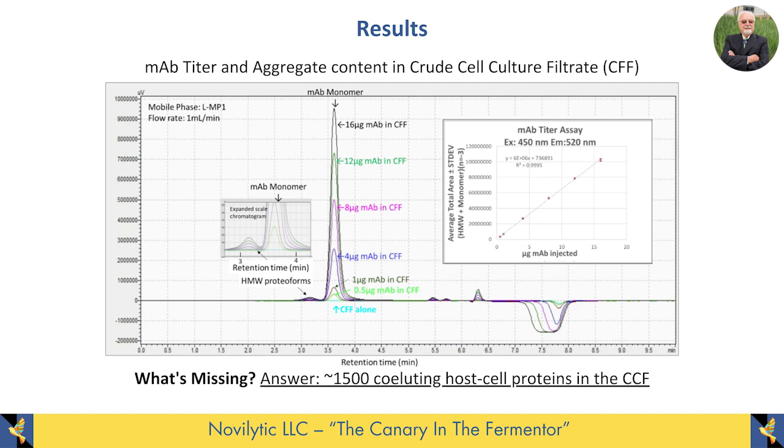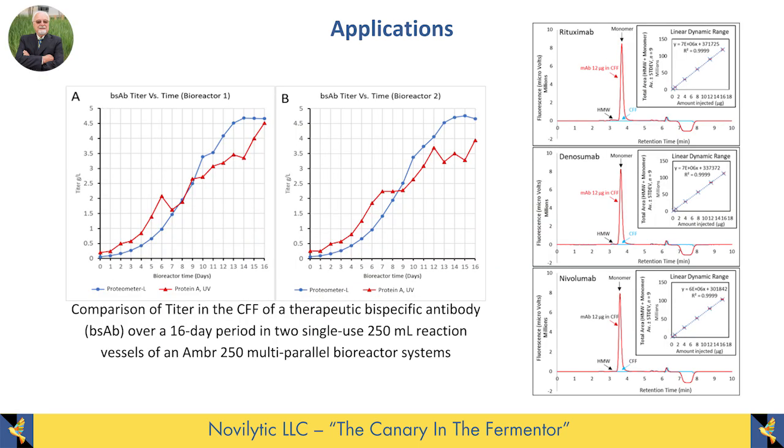You see a little tiny peak out in here that may be due to some of the coating agent binding to other proteins, but it's so small that it doesn't interfere. So going on, if you actually take this and look at the production of a monoclonal antibody in a fermenter, that occurs in about 2 weeks. And what you see is the production of monoclonal antibody with our molecular recognition assay.